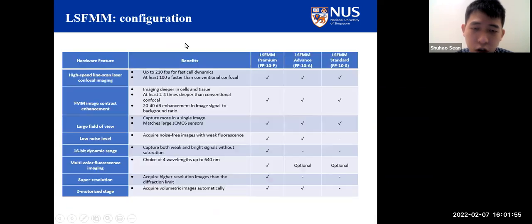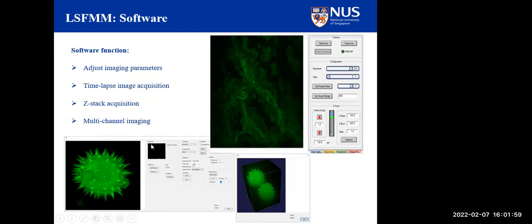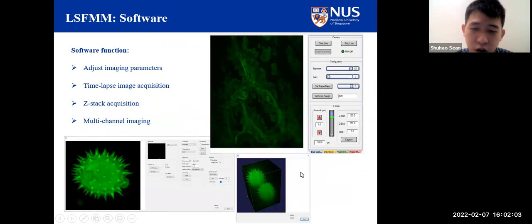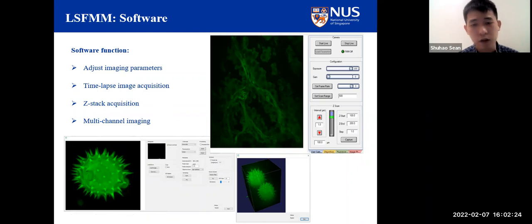As you can see, we have presented this processing software. This one is based on open source software called Vaa3D. Its interface is not as good as the commercialized one, Imaris, but we are now working to adapt our own software and integrate it into our own acquisition software.